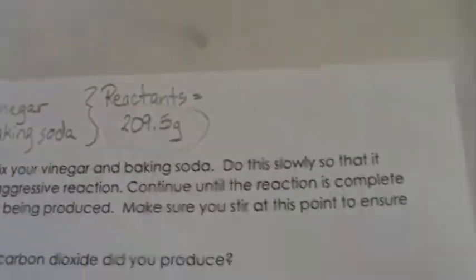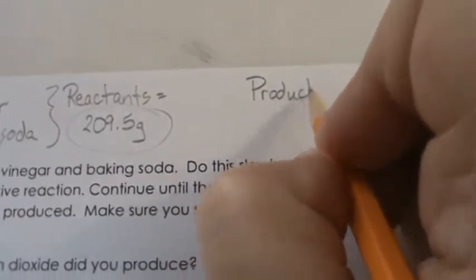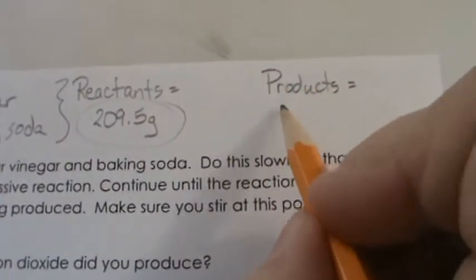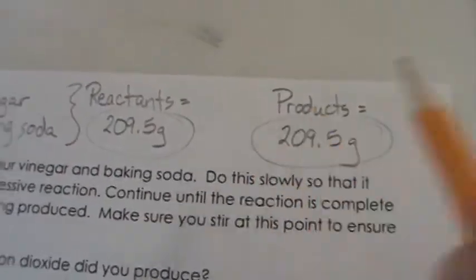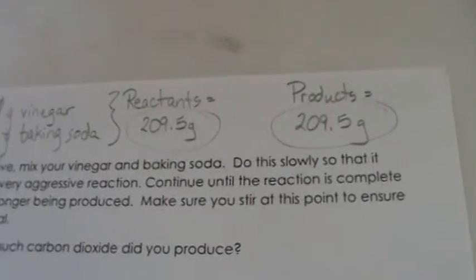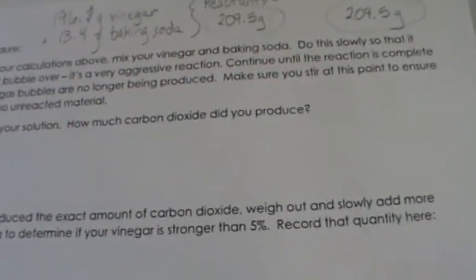Okay, well that means that our products also have to equal 209.5 grams. That's basically what the law of conservation of mass is saying. And that's how we can figure out how much carbon dioxide is produced, because the carbon dioxide is the only thing that's escaping this beaker.